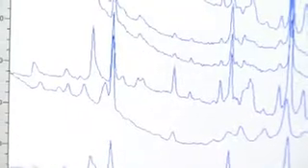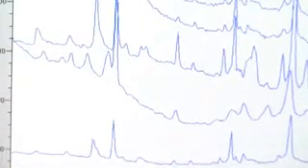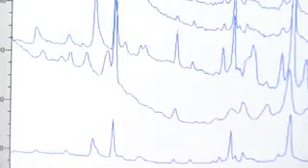This display, called a Raman spectrum, is made up of a series of peaks of different heights that represent a particular type of chemical bond in the ink. Different brands of ink may contain different chemicals, so their Raman spectra should also be different, thus providing a fingerprint or chemical signature that can be used to compare inks.